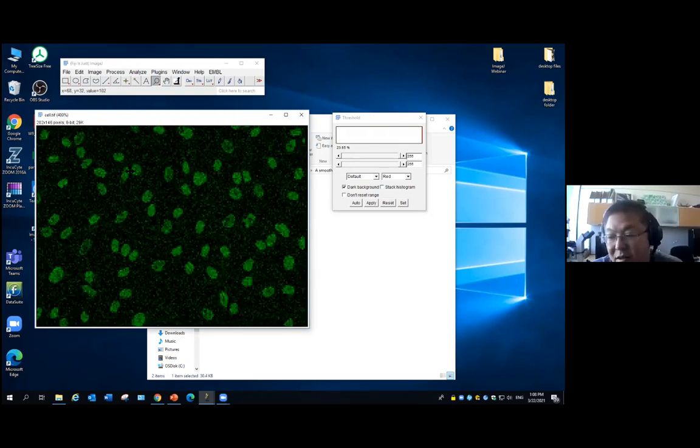And to do this, I will say the right way to do this is when you take the picture, you change your acquisition parameters to make it a better picture. If you're using the cameras, you choose a longer exposure time. If you're using a scanning confocal, you take more averages. You turn up the laser power and turn down the gain to make the noise less. So the ultimate way to solve this problem is to get a better image to analyze.